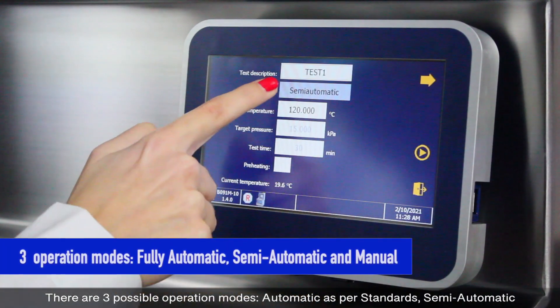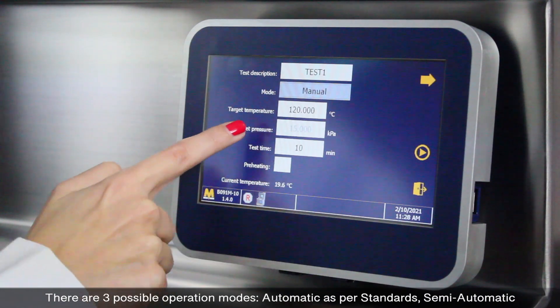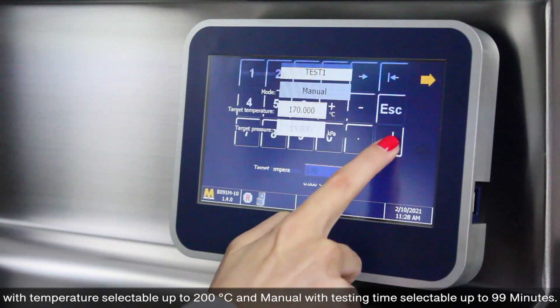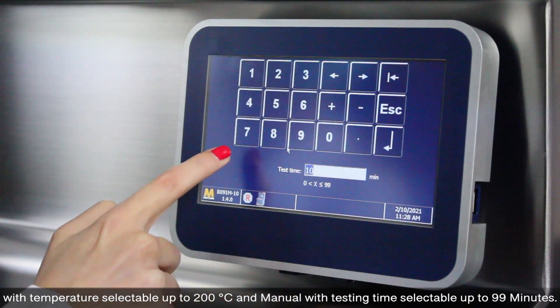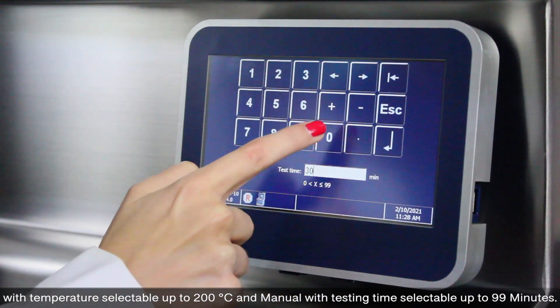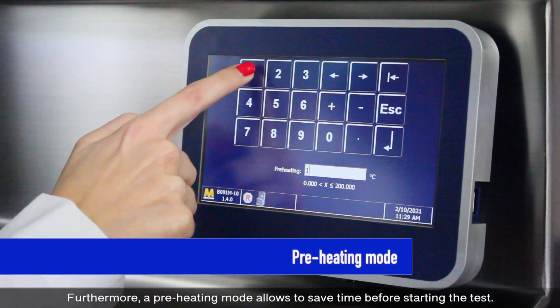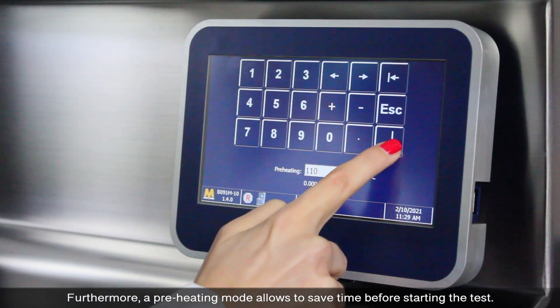There are three possible operation modes: automatic as per standards, semi-automatic with temperature selectable up to 200 degrees Celsius, and manual with testing time selectable up to 99 minutes. Furthermore, a preheating mode allows you to save time before starting the test.